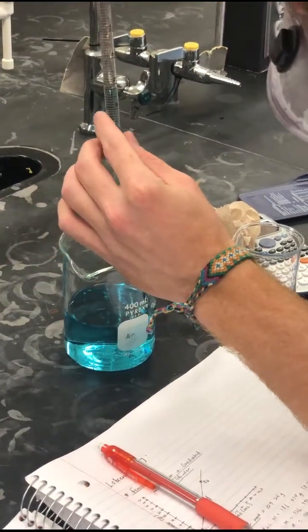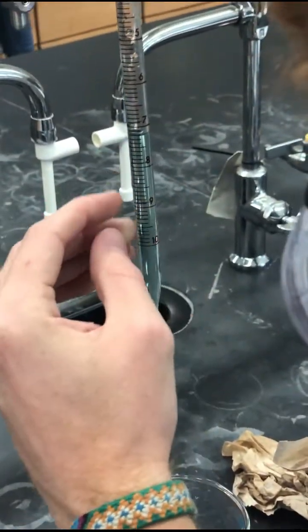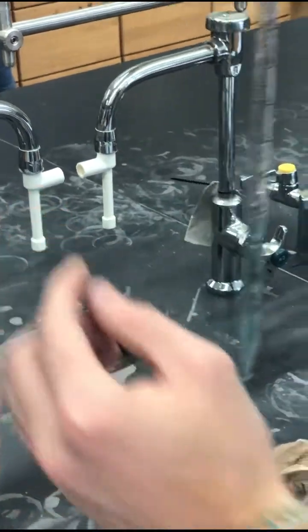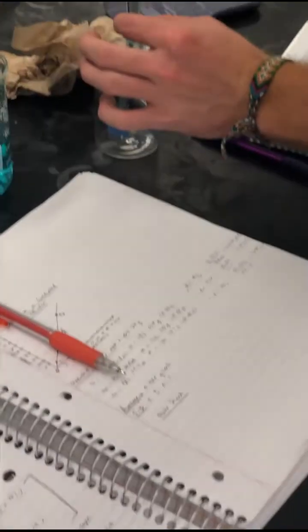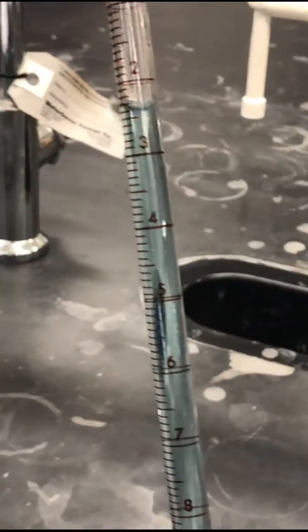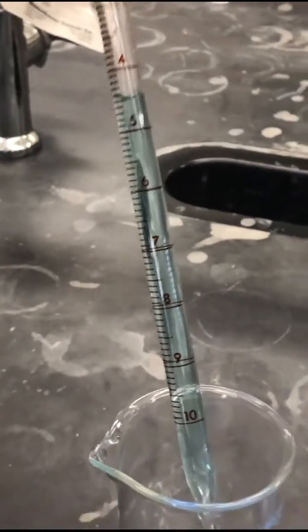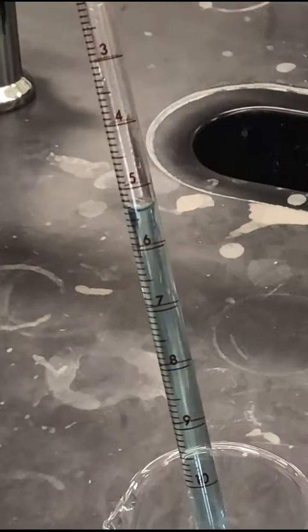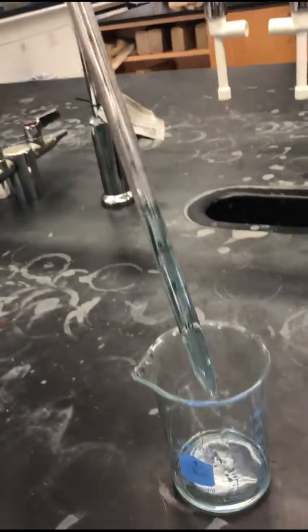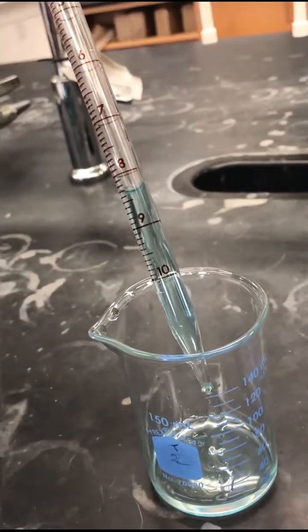That's like 6.8 or 2.8. That's 2.8. So that's 2.8 milliliters. We're letting it out to the 10 so we don't release any of the extra.